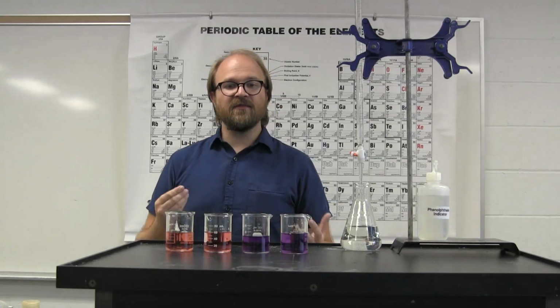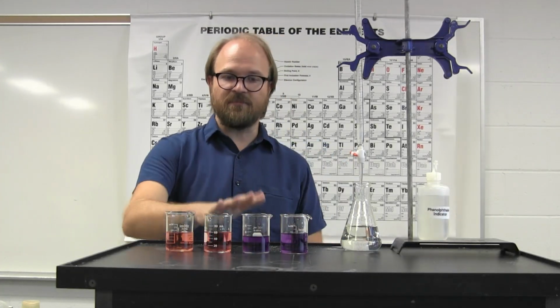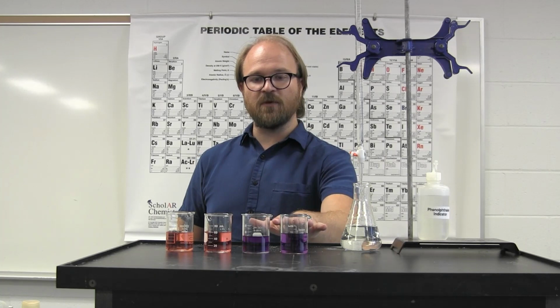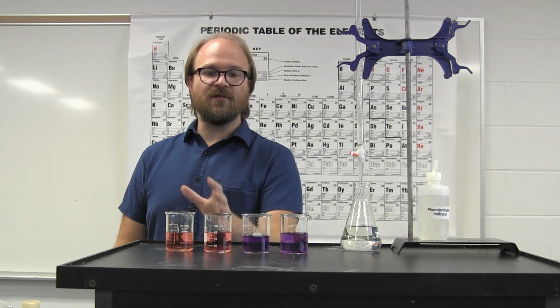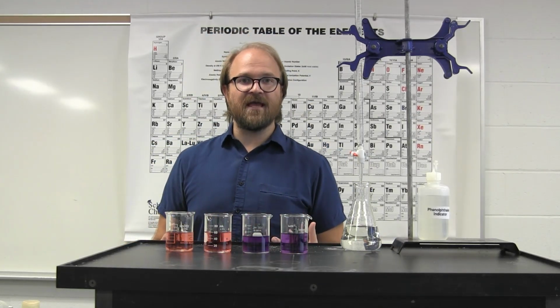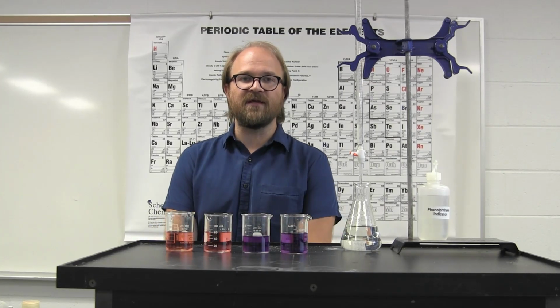Depending on the different colors and different combinations of acids and bases, the universal indicator can have a range between an intense purple, a blue, green, yellow, orange, or red color. That's because of the different indicators that are changing color because of the chemistry of the pH.